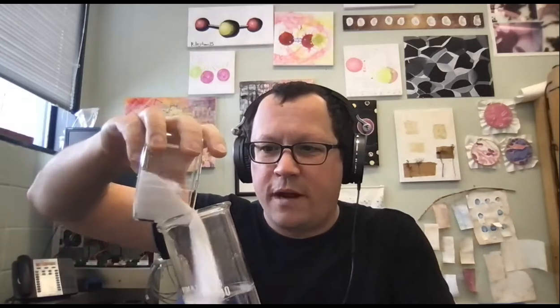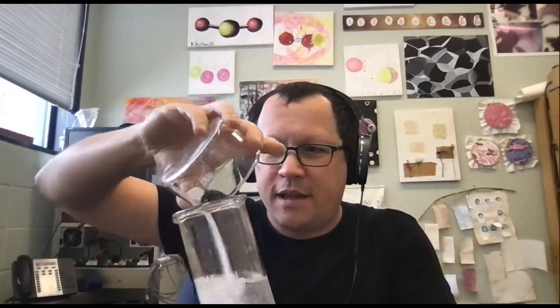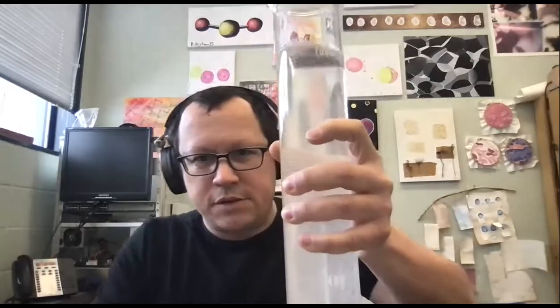If you have liquid in a graduated cylinder, it's generally going to be curved up at the edges, so you want to be measuring from the lowest point of the curve. That's called the meniscus, and that's where you want to measure. So I have 1 liter here. I'm going to add my 58.44 grams of sodium chloride into here. And now I have theoretically a 1 molar solution.